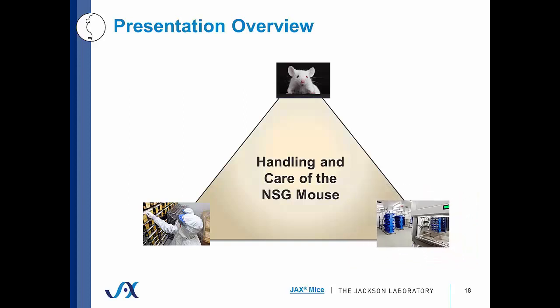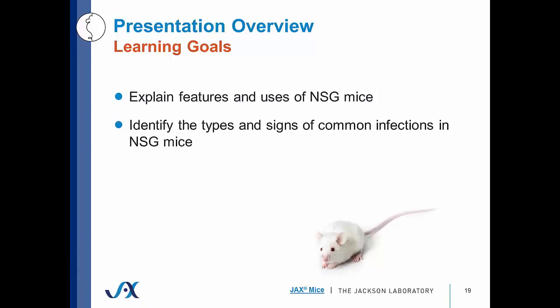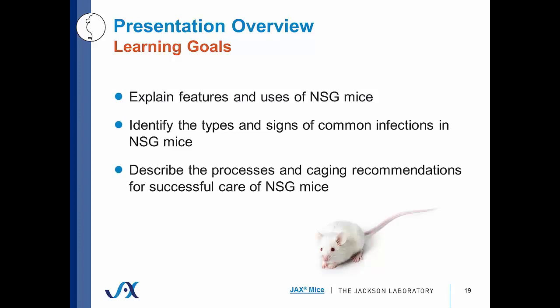So today we'll be discussing how each of these considerations work together and how you can take them all into account when you're caring for and using NSG mice. By the end of today's presentation, I hope that you'll be able to explain the features and uses of NSG mice, as well as identify the types and signs of common infections in NSG mice, as well as describe the processes and caging recommendations. So let's talk about some features and uses of NSG mice.